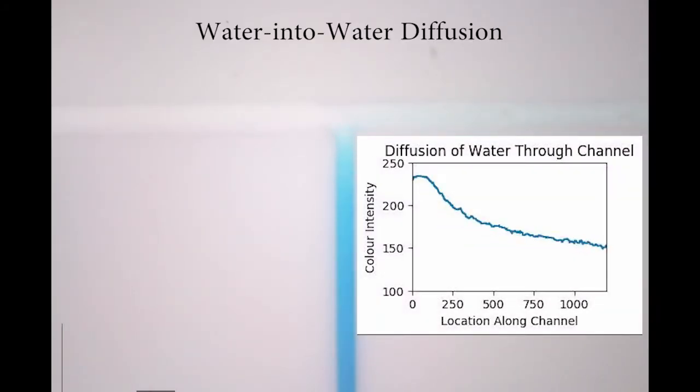Our last video covered the self-diffusion of water into water using a microfluidic chip. This video will use the same chip to investigate the diffusion of pentane into unrefined Pennsylvania crude oil.